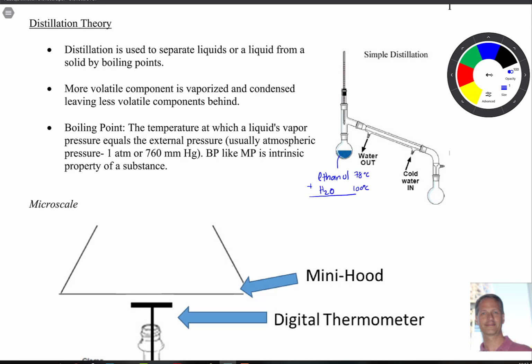Now, there's some stuff going on here as far as vapor pressure and Raoult's law, for example, but to imagine that, you take this and you put this in a water bath. You got water right there, and then you got your hot plate down here. As you start to add heat to this, the ethanol is going to come off first.